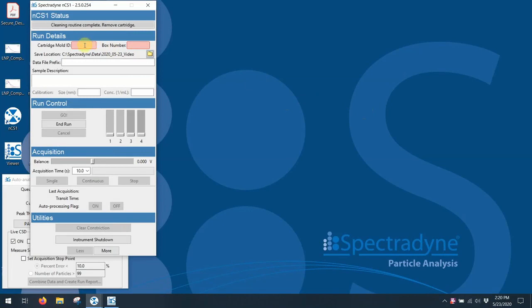So here I am looking at the NCS-1 software, and the first thing I need to do is to type in a mold ID. The mold ID field tells the system what type of cartridge it is, and its mold ID. This looks up a factory default calibration value for both size and concentration. So this is one of the beauties of the NCS-1 system. There is no calibration required. So I simply type in the mold ID, in this case P12.4.4, and you'll see the field turn green instantly because it recognizes this as a valid cartridge mold ID.